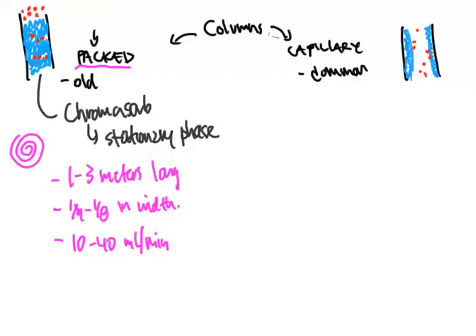Chromabsorb. What is Chromabsorb? I mean, this is kind of a registered trademark name in a way. There's got to be something with Chromabsorb, though, right? What exactly is it? A lot of times, not every time, but a lot of times it's something that we refer to as diatomaceous earth. Okay, now if I wanted to spell that, diatomaceous, diatomaceous.